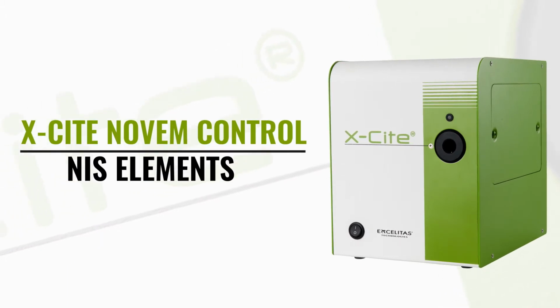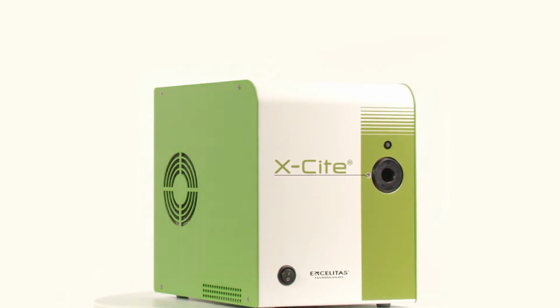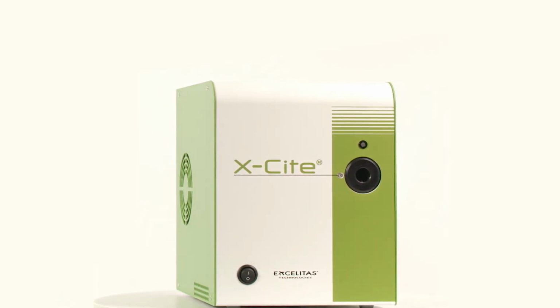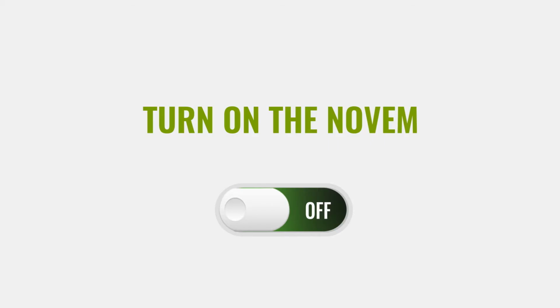X-Cite NOVEM Control, NIS Elements. NIS Elements uses Turbo drivers to control the NOVEM. To have access to all LEDs in the NOVEM, ensure that all groups have been set up per the NOVEM installation video. To get started, connect your NOVEM to the computer via USB and turn on your NOVEM.